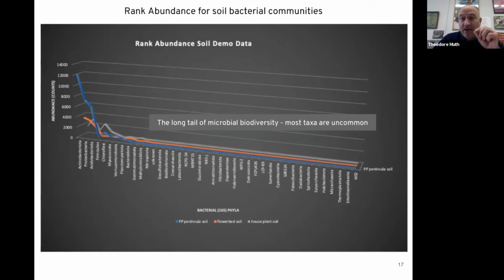Since that's the only game in town for the PCR to amplify, it just amplifies that contaminant through the roof. That showed up as more than 80%, I think, of that particular sample. In a case like that, where it's a negative control, you can be pretty sure that it's a contaminant. But from the houseplant soil, it's harder to say, because yes, it could have been a contaminant, or maybe it wasn't. So I'm not sure if I'm answering your question, but you can usually try to figure it out. Yeah, so that was me asking the question.